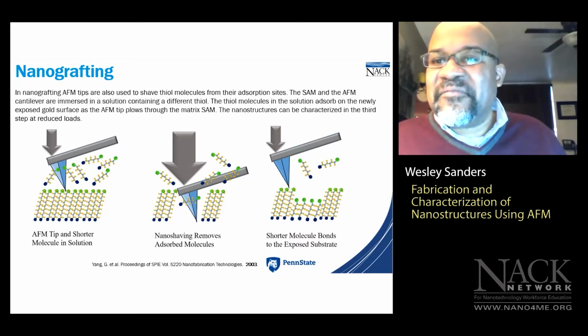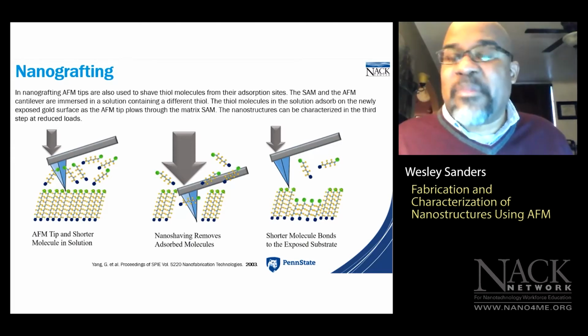I was wondering, how do you make it go up and down? Do you have to move the whole thing, the force microscope? Does it have to be moved mechanically, or do you do it electrostatically, or what do you do? So you mean the probe? How do you move? Yeah.